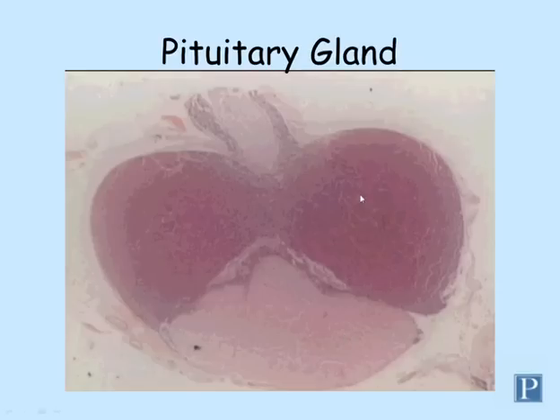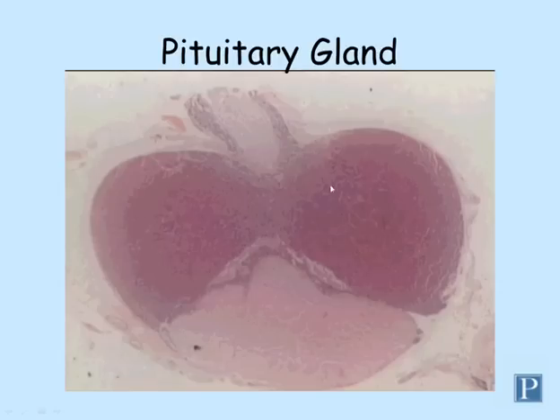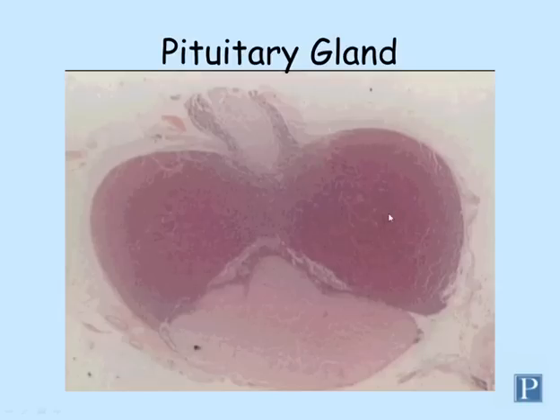Here's another section with a different angle. You can see the pituitary stalk up here. The lighter-staining region in the center is the infundibulum, which is surrounded by pars tuberalis on either side where it wraps around. Here you can see pars distalis, pars intermedia, and pars nervosa. Most of your sections will not have the pituitary stalk, so be able to identify those structures in photographs and on the PowerPoint slides. For your particular slides, focus on these three parts: pars distalis, pars intermedia, and pars nervosa.